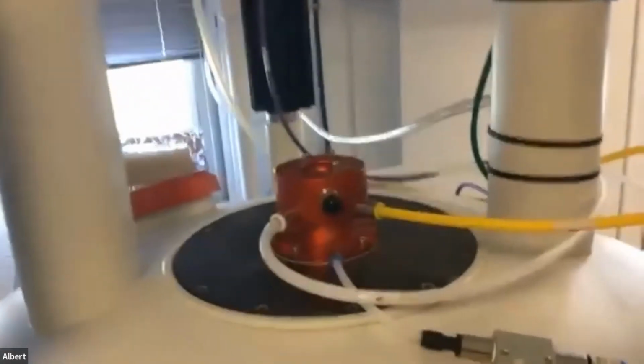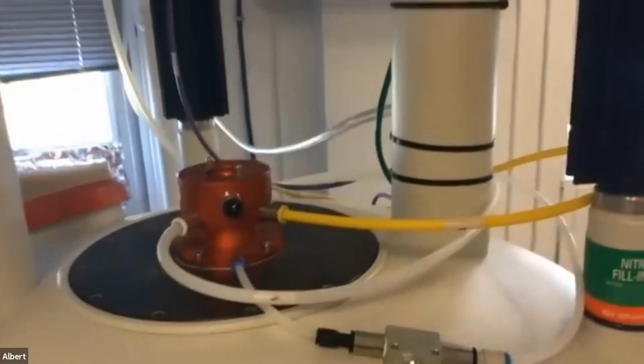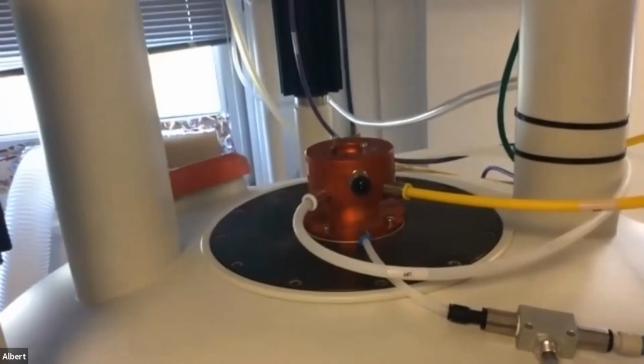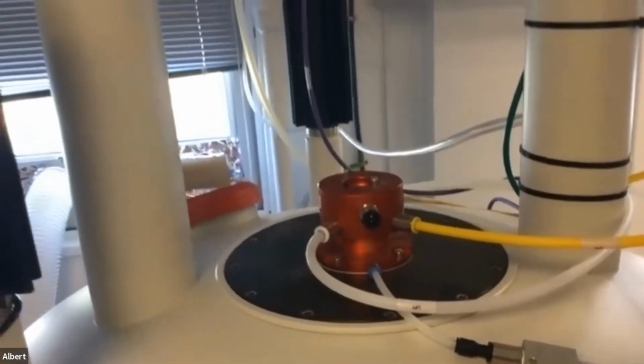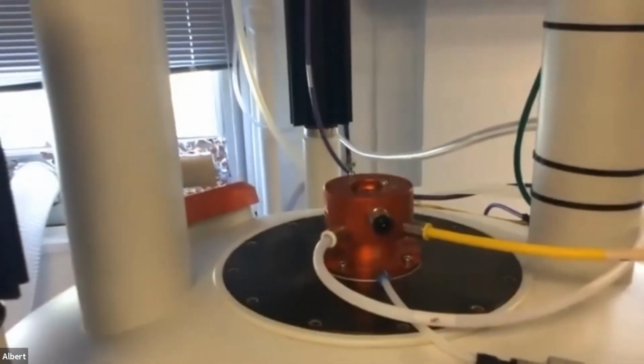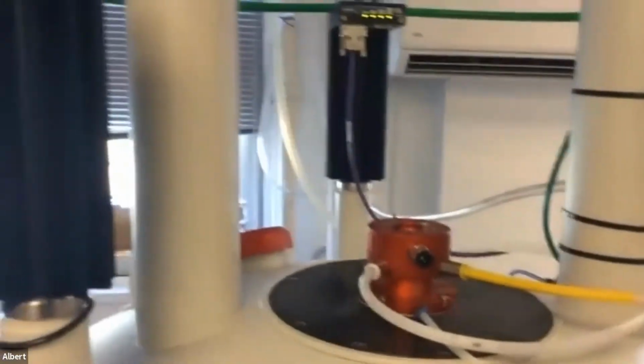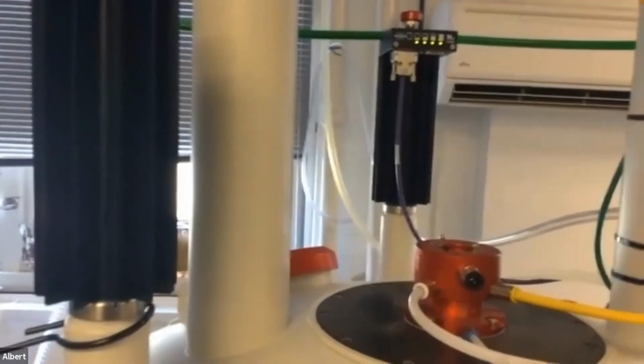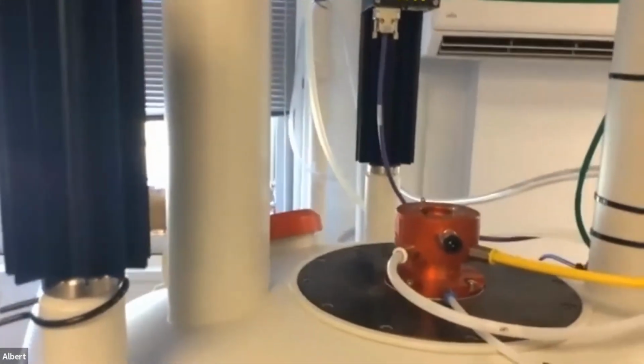And type EJ. You see the red stop sign button up there? Oh, yeah. Click that. Yep. And then type in EJ and eject the sample. Will it pop up anything about the quick stop? Yep. And you'll see the sample pop out.